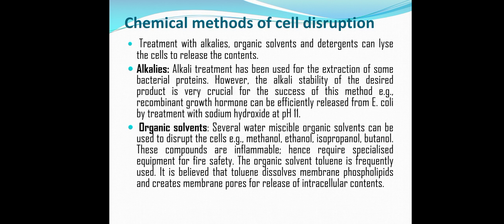Now we will switch over to the chemical methods for cell disruption. Within this there are three techniques: the use of alkalis, organic solvents and detergents. Alkali treatment can be used for the extraction of some bacterial proteins. Whenever we utilize this technique, one point is taken into consideration: this method can be applied only to the extraction of intracellular products which have alkali stability, which are stable at alkaline pH.